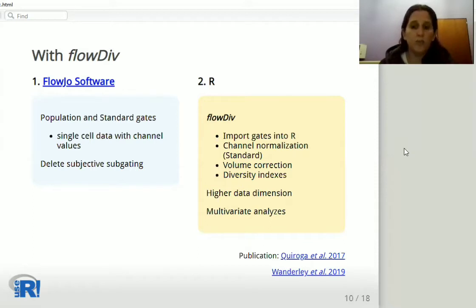This output has higher data dimensions and can be further used for multivariate analysis in R.